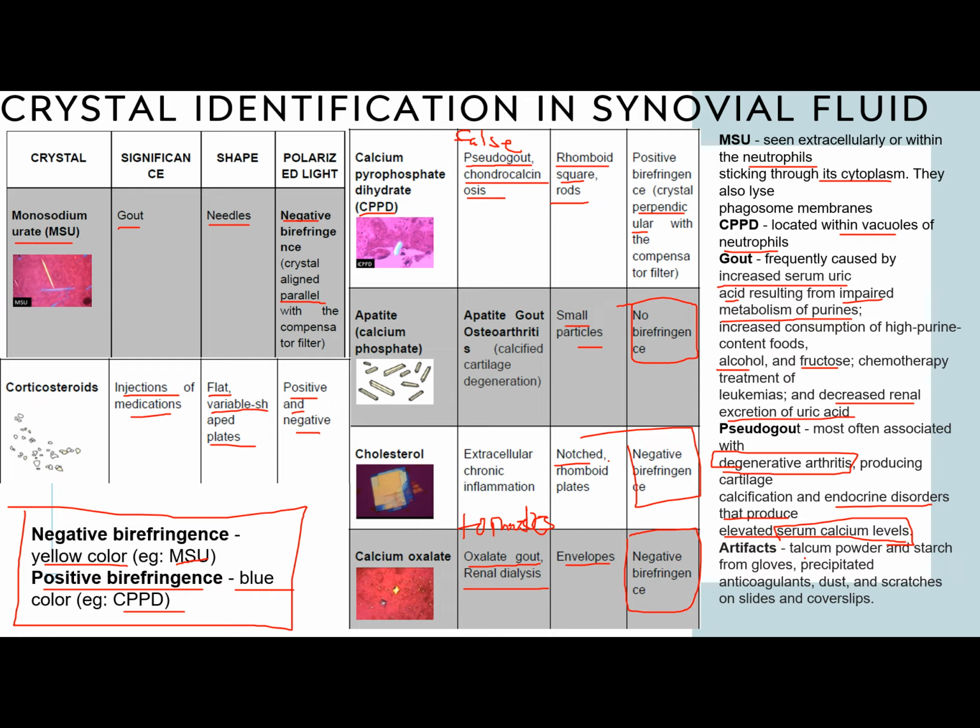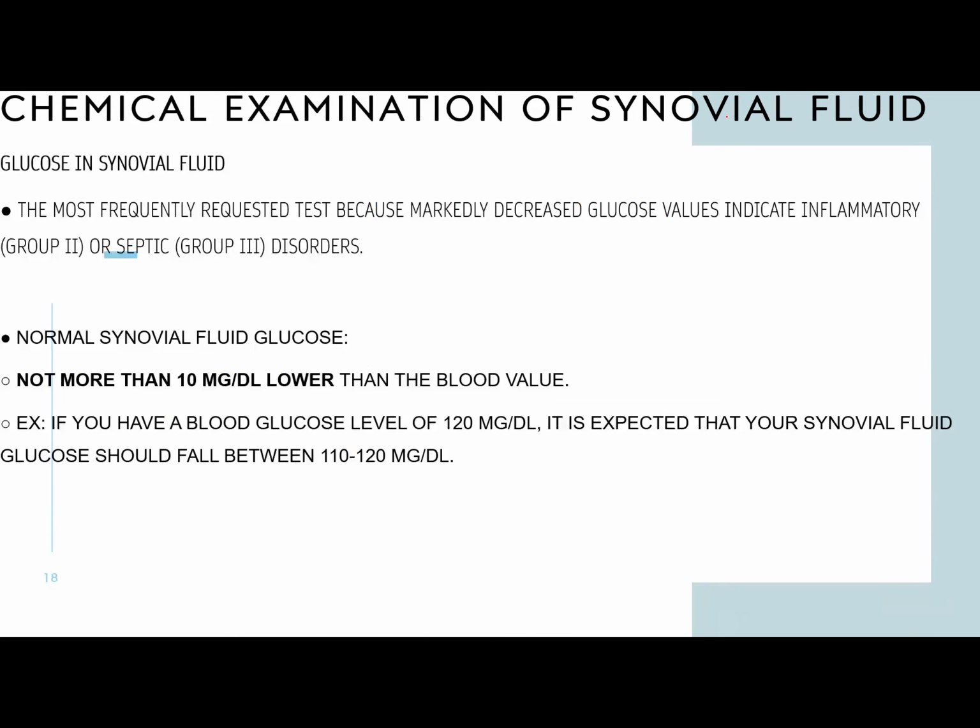Then artifacts could also be seen, class, such as your talcum powder and starch from gloves, precipitated anticoagulants when you use powdered anticoagulants, dust and scratches on slides and cover slips. That's why it's very important, class, that you do not reuse slides when you view bodily fluids.